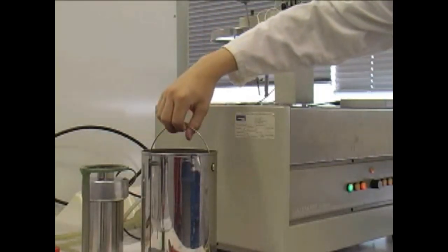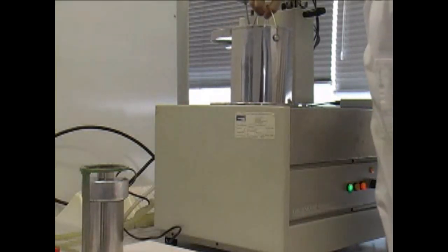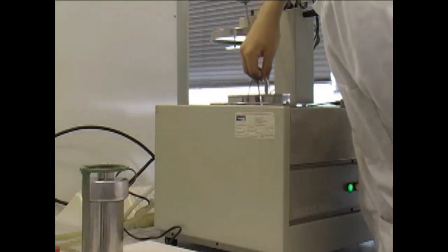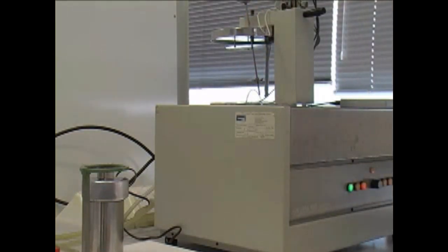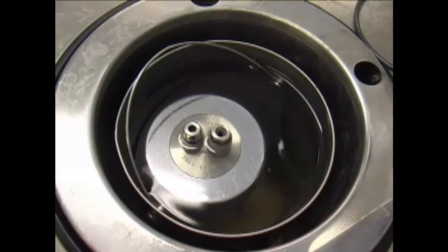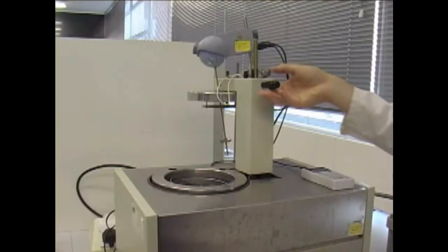The calorimeter is now assembled. A can of water is inserted. The can plus its contents weigh is actually 3 kilos. The assembled and pressurized bomb is then inserted in the can. The lid of the calorimeter is closed.